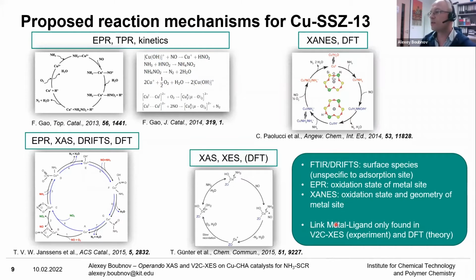But if we want to link these two, here I will introduce the valence-to-core X-ray emission spectroscopy, which is able to probe both the elementally specific site, the catalytic site, and also the ligand, which is adsorbed onto it. And of course, this can be theoretically modeled by DFT.